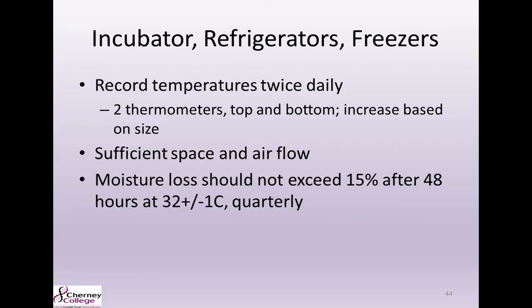Make sure that your incubators have sufficient space and airflow, and your moisture loss should not exceed 15% after 48 hours at 32 degrees C. And it's a good idea just to check that quarterly to make sure, like I said, that you're not dealing with any water loss that's going to dry out your plates.